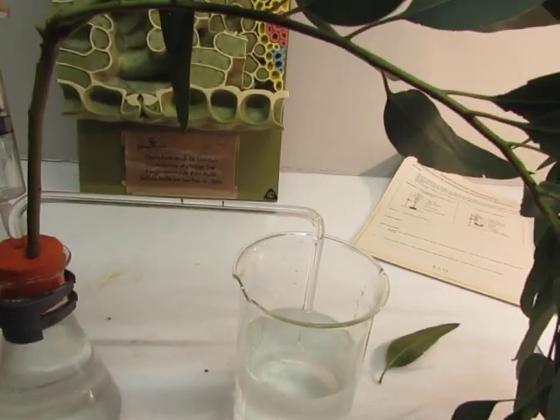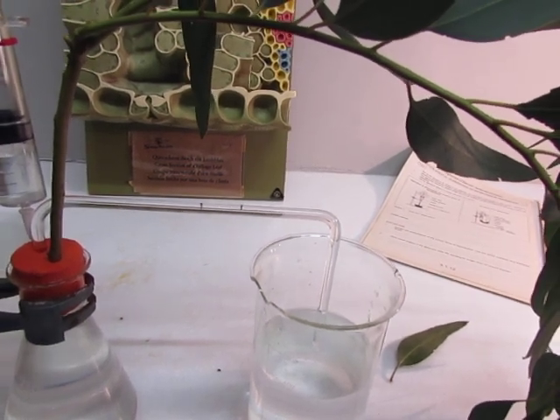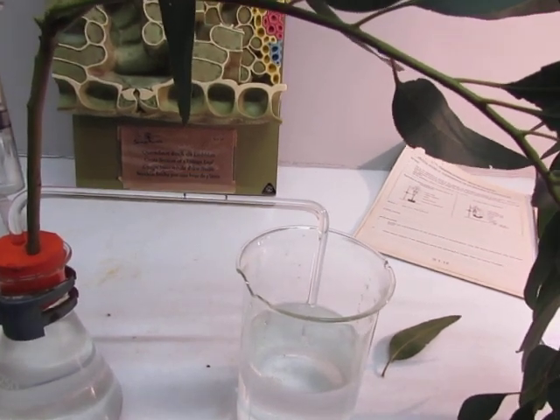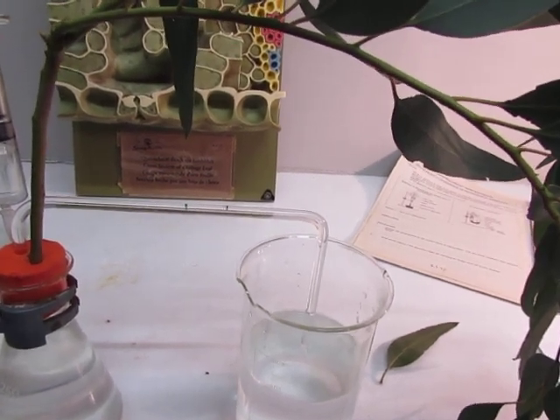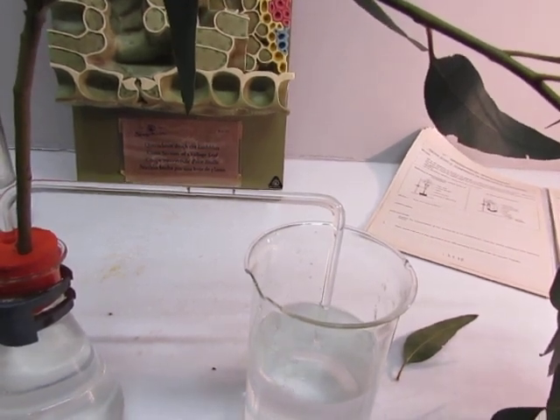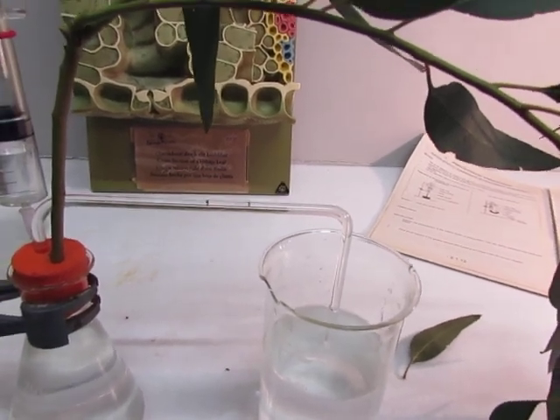Now I push the air bubble back, and then I wait for it to start moving again. Can you see how sensitive the plant is? The slightest movement whatsoever has an effect on the movement of the bubble. So there it's now moving back to the first mark, and I can discuss the other factors that we're going to use.